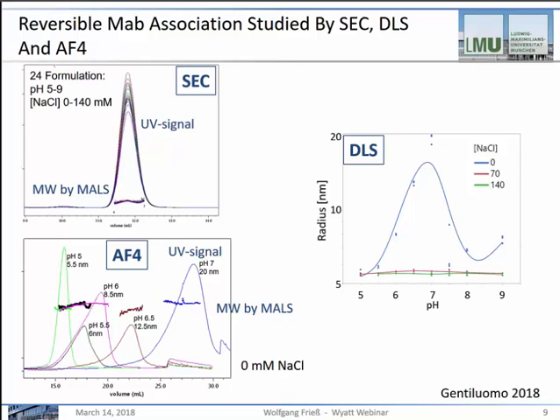So at the detector, we always see the monomer, but the retention of the sample is more related to the initial radius. So upon focusing and applying the sample in the AF4, we do see the retention, the size increase, but then dilution occurs, and we get sort of a mixed effect, and we don't see any effect at the detector end.